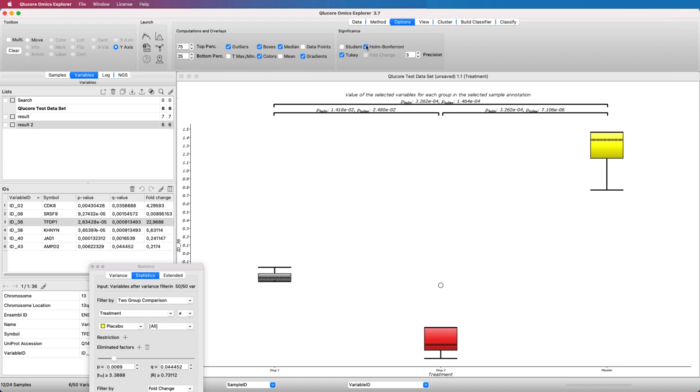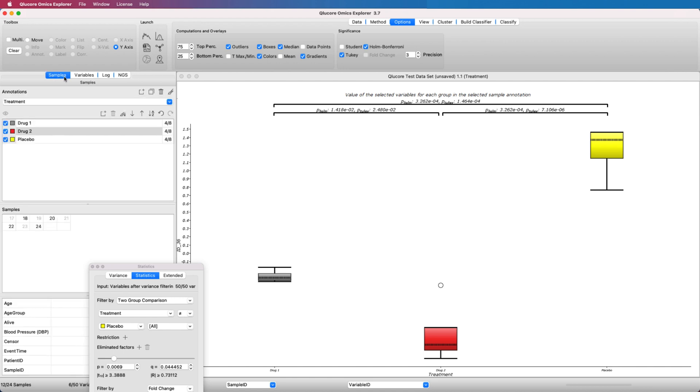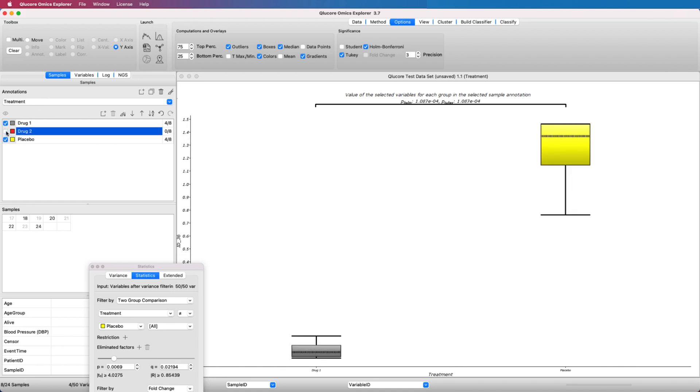The box plot is interactive and to demonstrate this, we deselect one of the treatment groups and the plot is immediately updated to reflect the change settings.